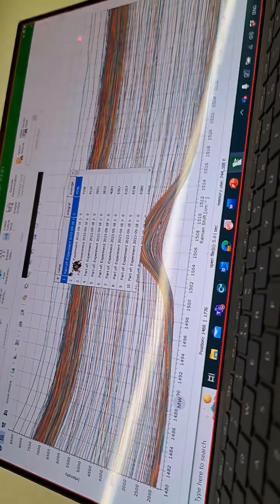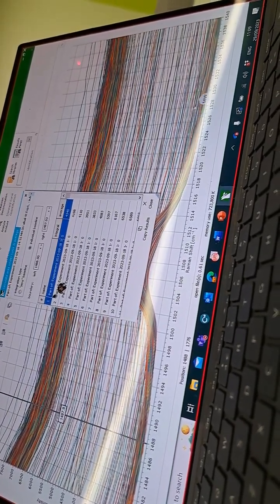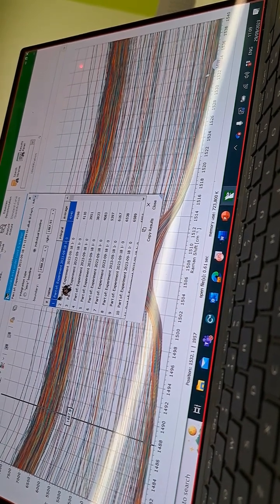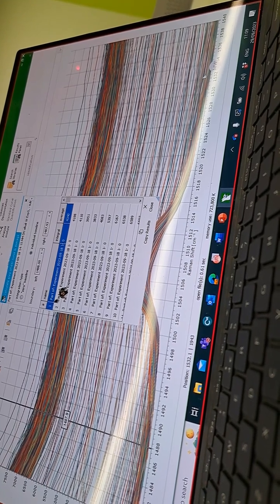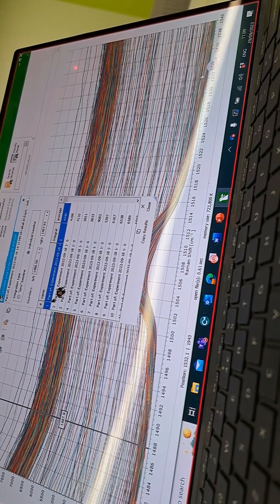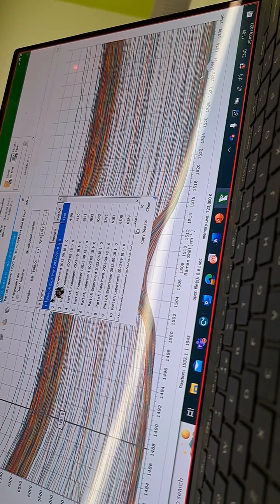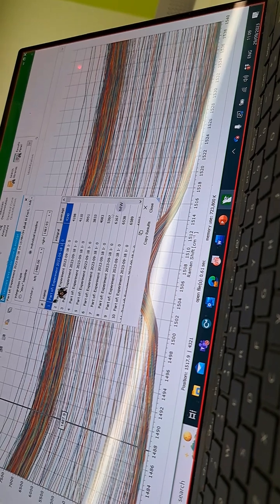So how can I plot the graph with respect to time, so that with the passage of time, the area was low, and then it starts increasing? You need to get the area out for each one, and then you need to know the time point each spectrum was collected. Okay.